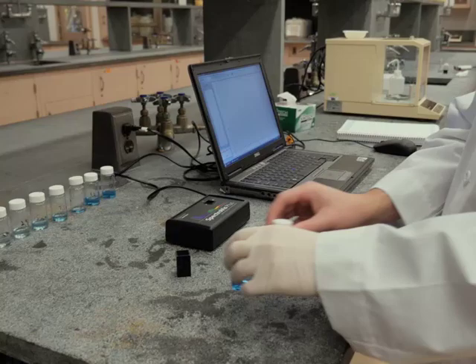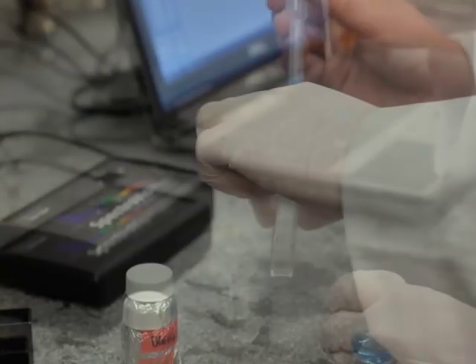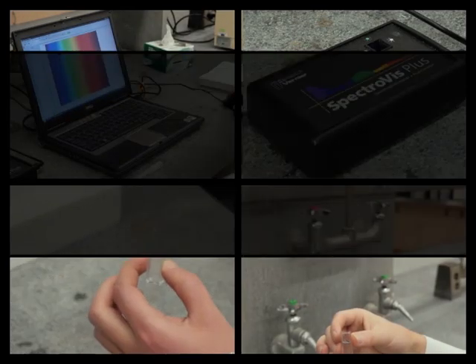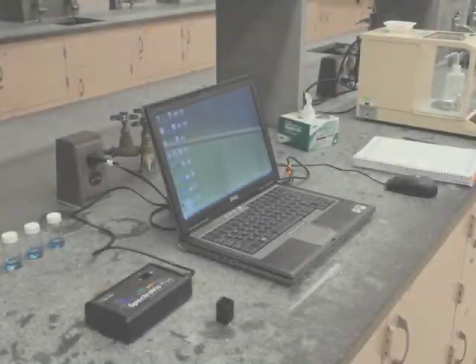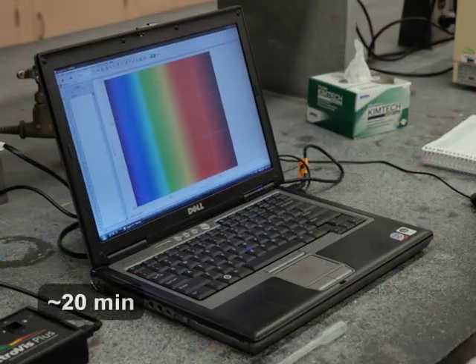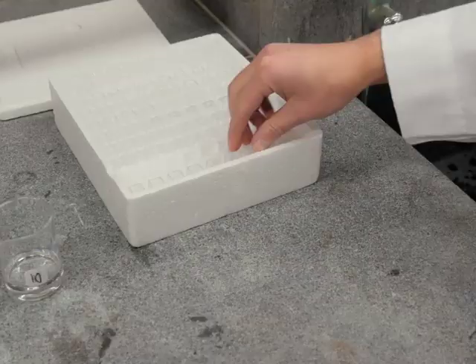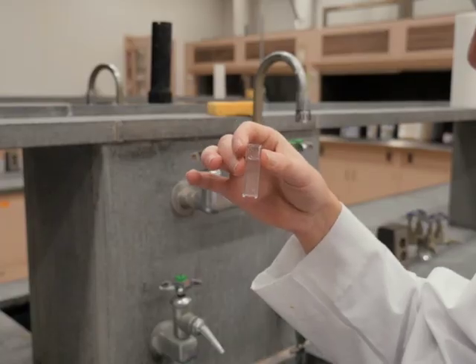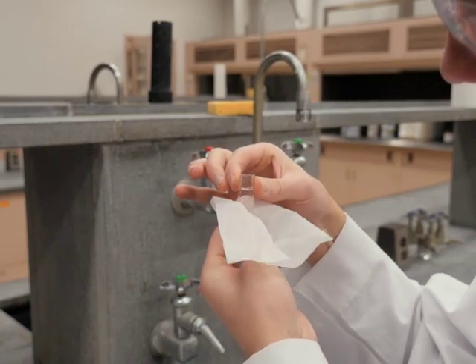Now that the basics of UV Vis spectroscopy have been outlined, let's take a look at a simple UV Vis experiment in the laboratory. Before beginning the experiment, turn on the spectrophotometer and allow the lamps to warm up for an appropriate period of time to stabilize them. Prepare a blank by filling a clean cuvette with the sample solvent, and then wipe the outside with lint-free paper to remove any fingerprints.